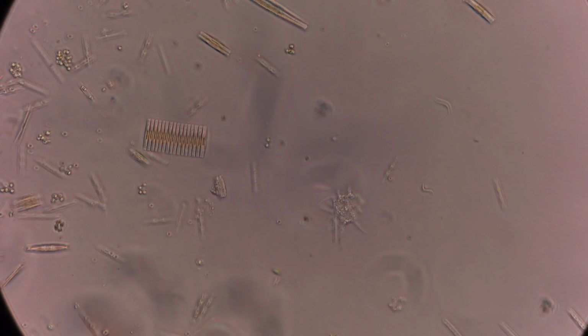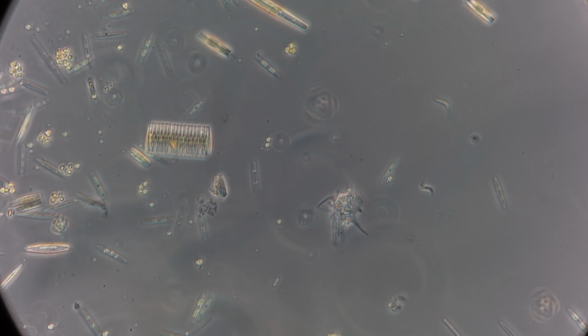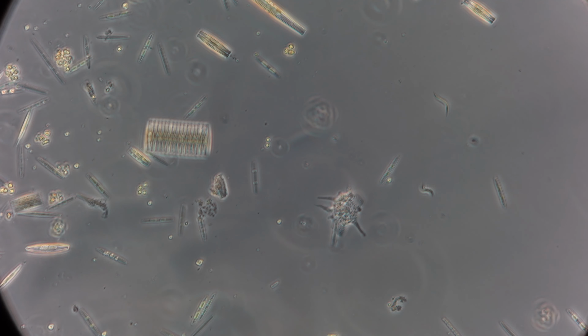These take a while to move. Amoeba. Is that the little one? This one. Oh, you've heard of amoebas? Yes. Well, I followed one today for 1.5 hours. They take a really long time to do anything, but you have to record it and then speed it up. But it's slowly doing something.